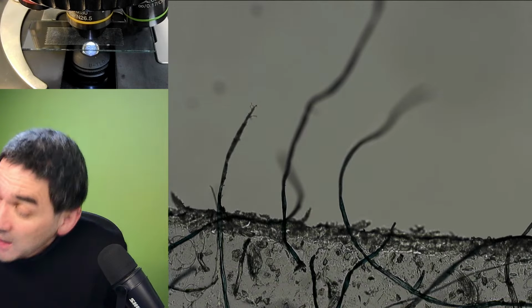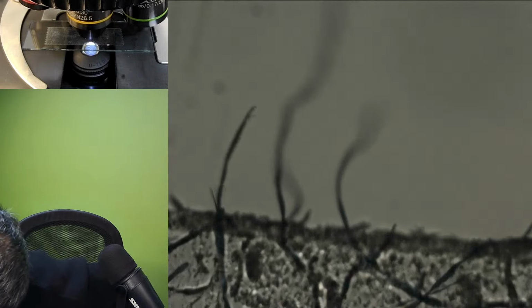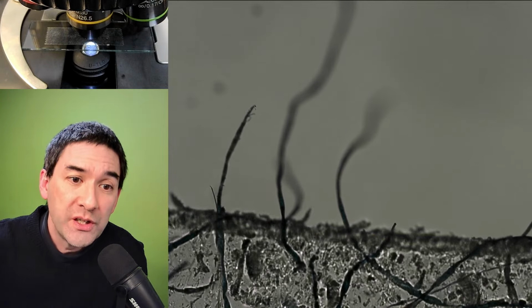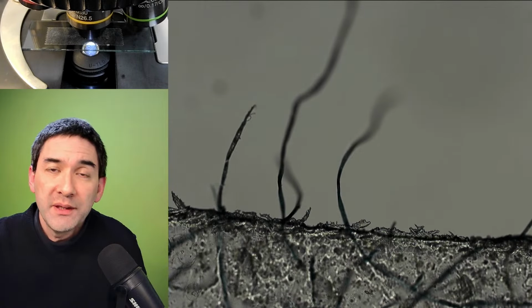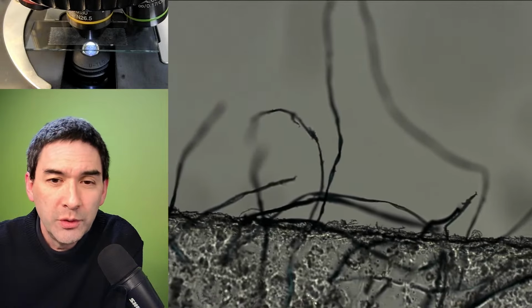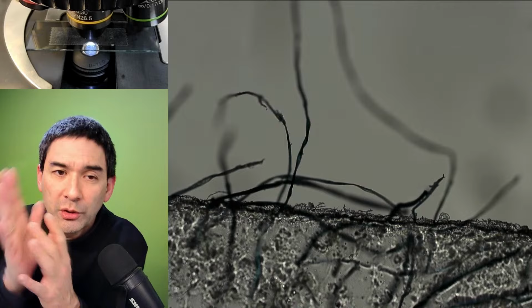And what happens is, when you breathe on them, sometimes, because they absorb moisture, they start moving, right? This is something that they have seen, and then all of a sudden they thought, oh my gosh, these are moving worms. No, they're not. Those fibers just absorb moisture, and therefore they start deforming.